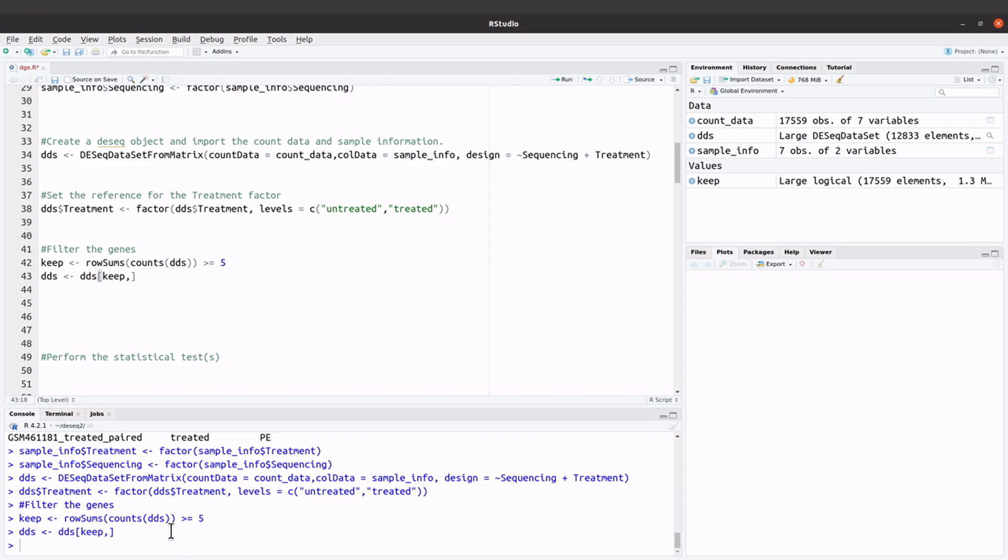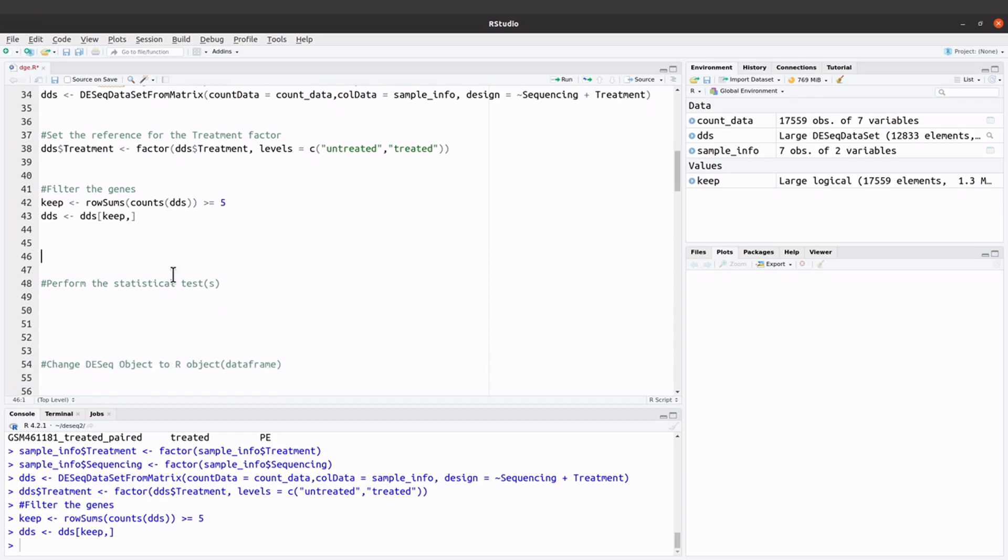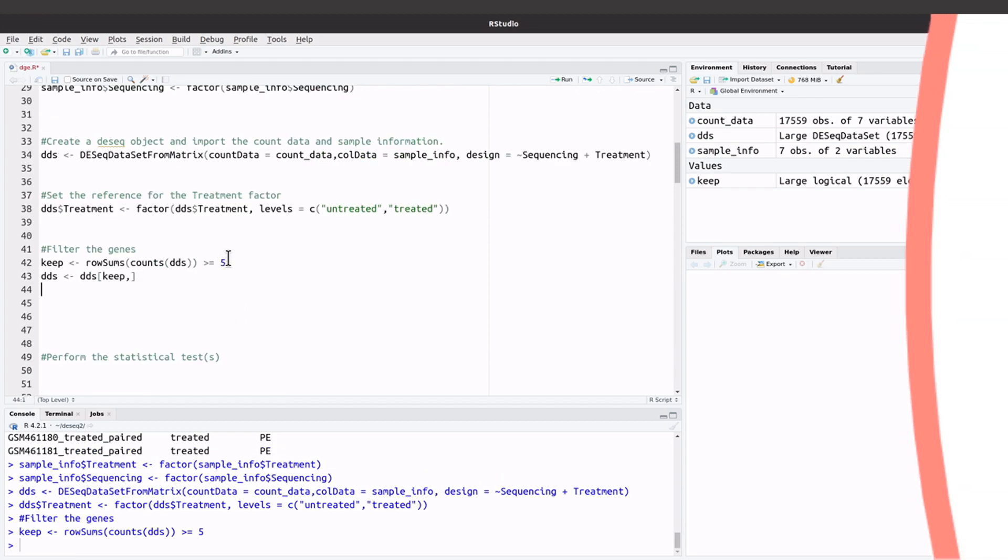So now we are going to perform the differential expression analysis. So we will do that by running another command and then DESeq to perform some statistical tests. So that is what I have here.